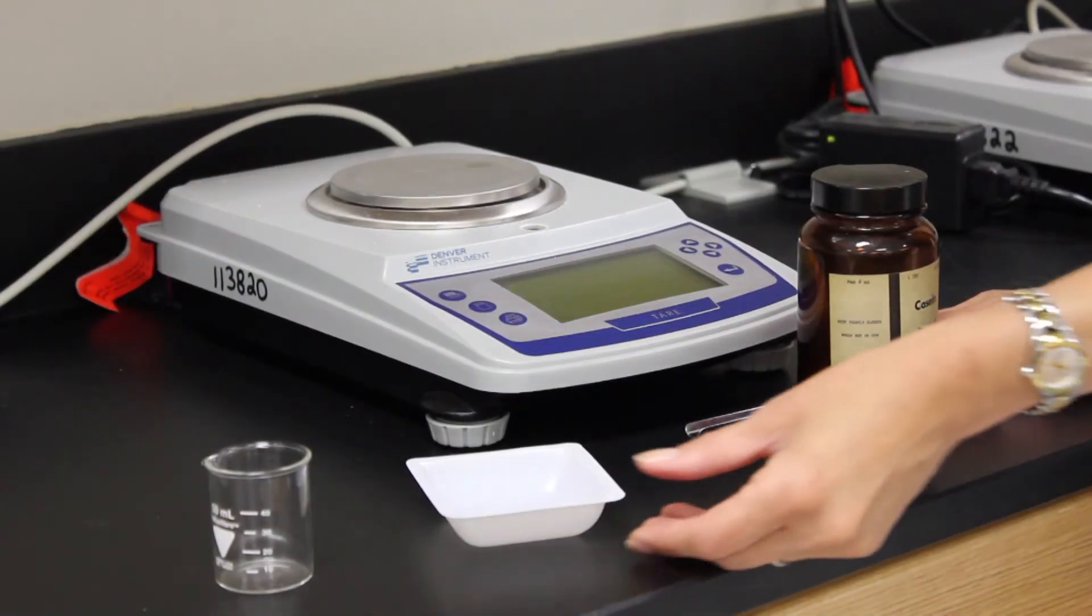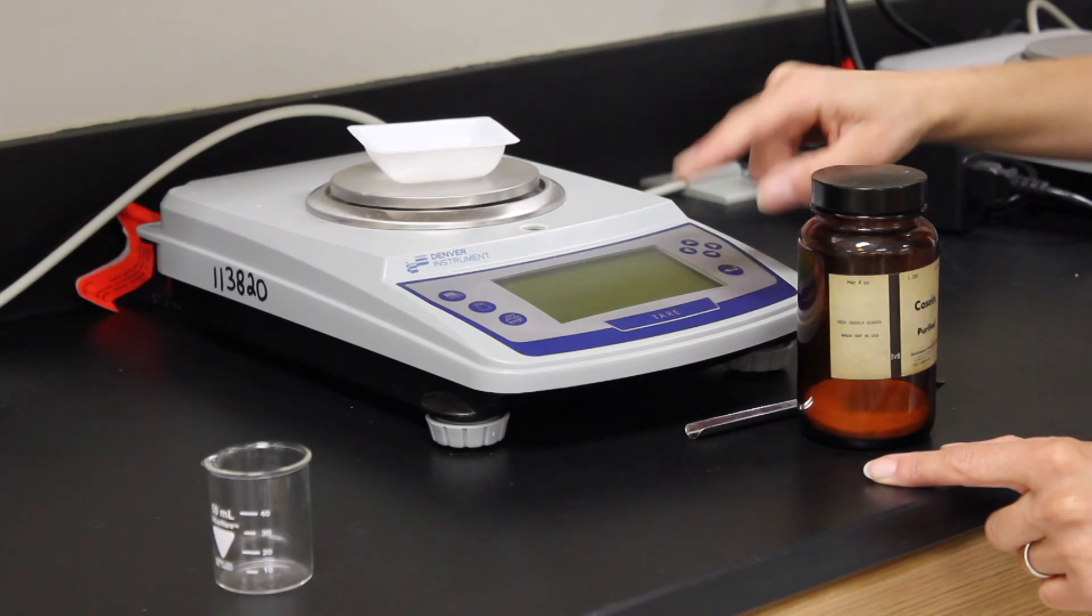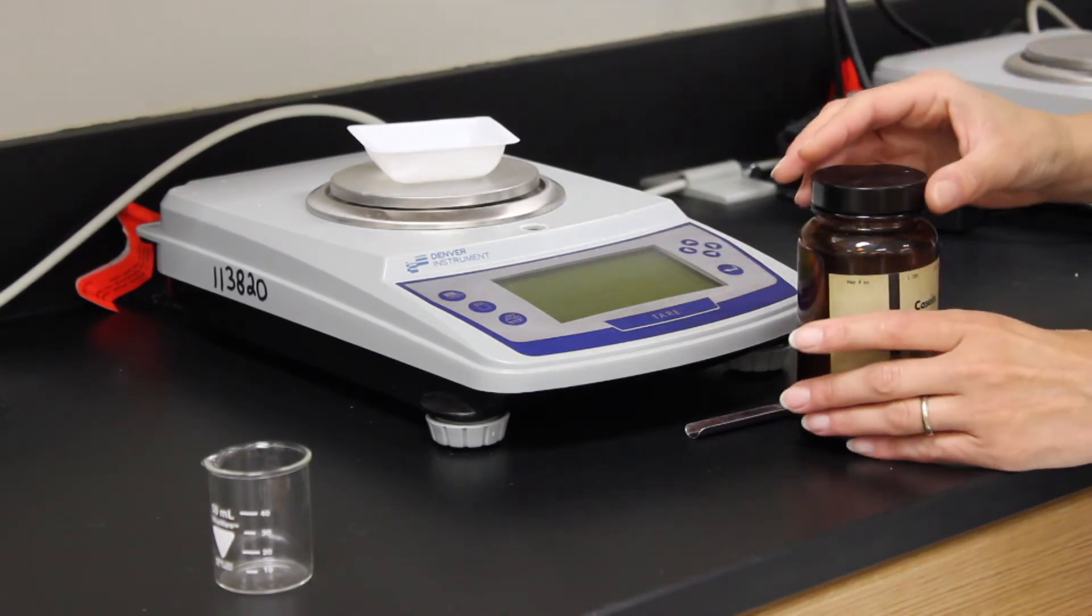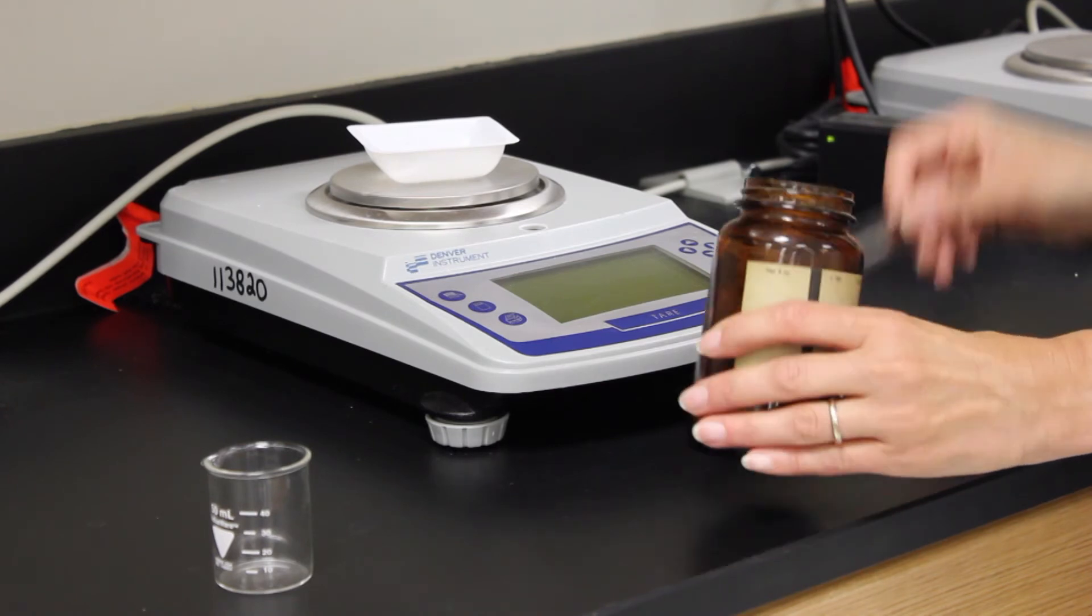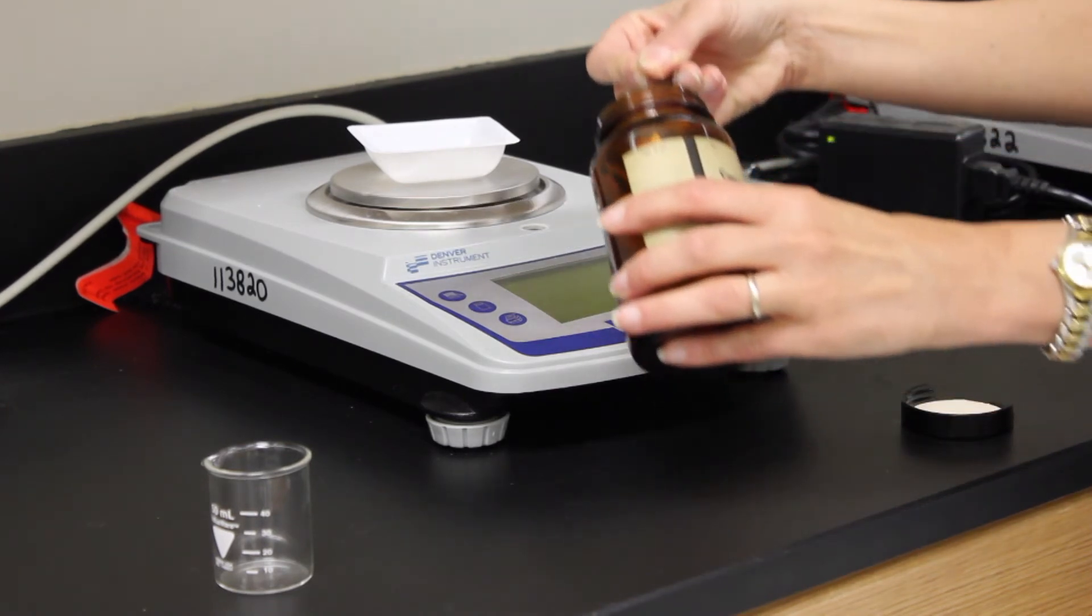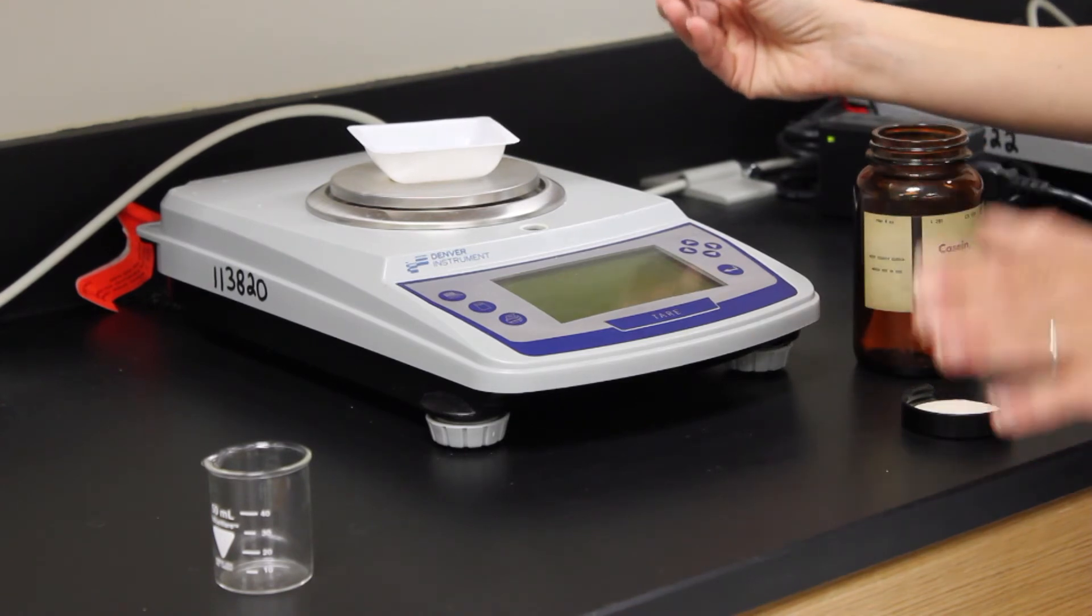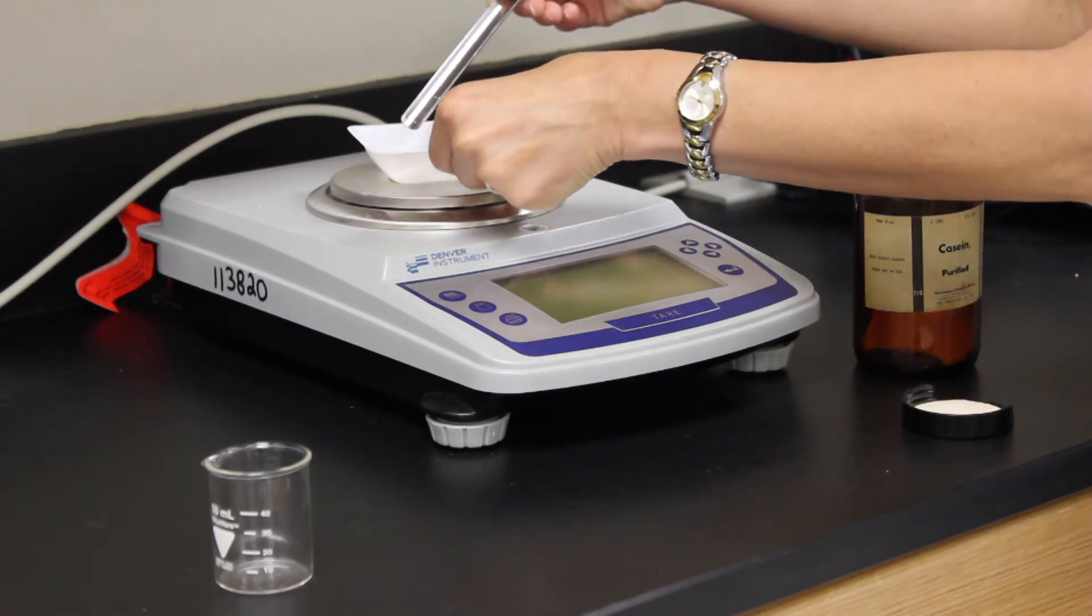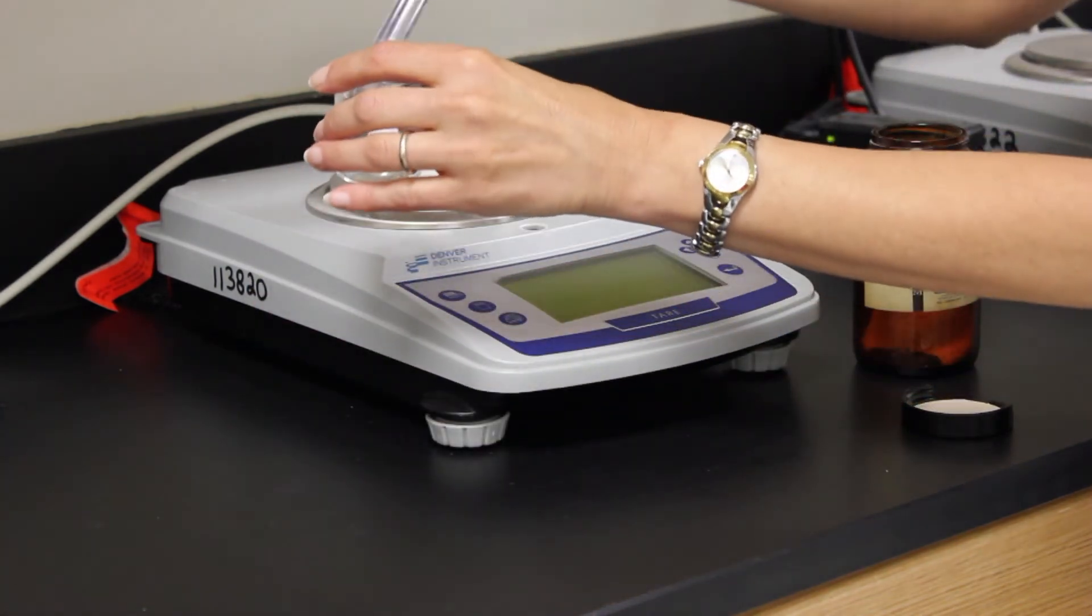Here is a demonstration of the proper way to weigh out a solid. First start with a weigh boat and tare the balance. Use a scoopula to obtain the amount of solid needed. If too much is used, do not put it back into the original container. This could contaminate the entire bottle. Dispose of any extra in the appropriate waste container.